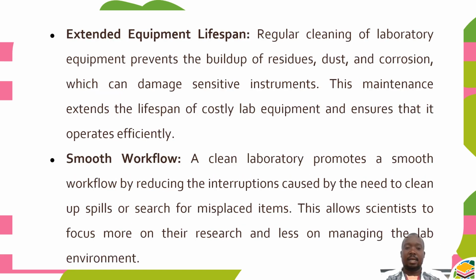Then cleanliness will also achieve extended equipment lifespan. Regular cleaning of laboratory equipment prevents the buildup of residues, dust, and corrosion, which can damage sensitive instruments, and this maintenance extends the lifespan of costly lab equipment and ensures that it operates efficiently.